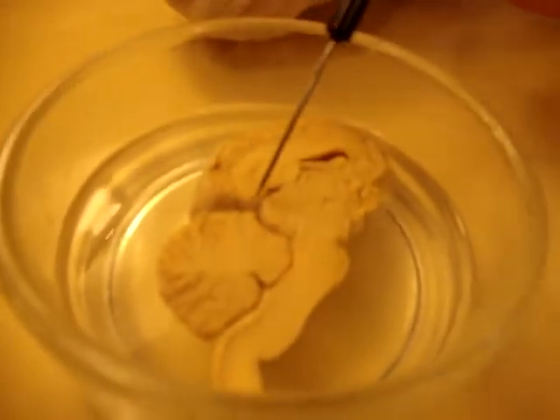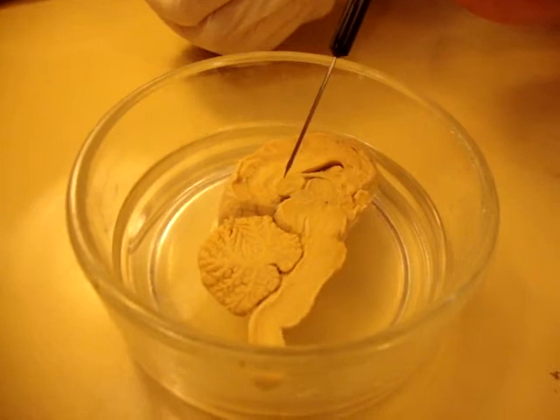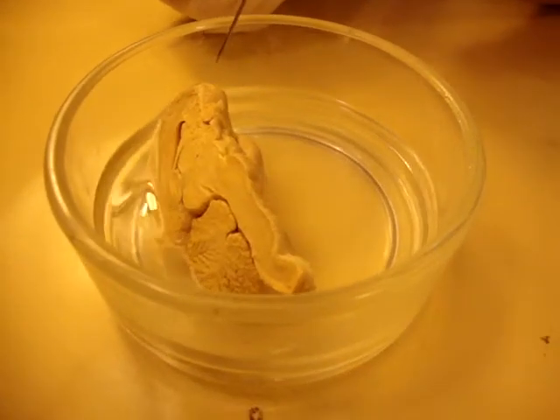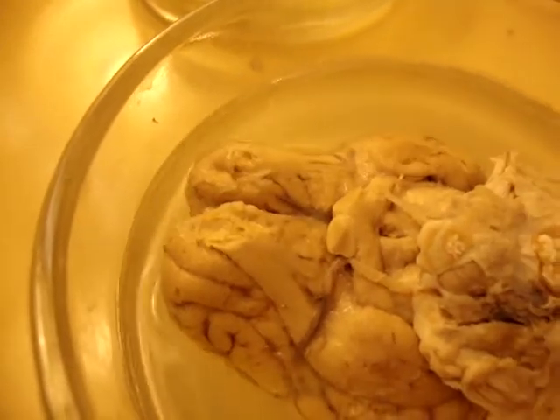Okay, we've got your cerebral cortex here, and then the corpus callosum is this sort of separating thing here. And then you've got an olfactory bulb there, and you can see them quite well here. You can see where the nerves go into them.